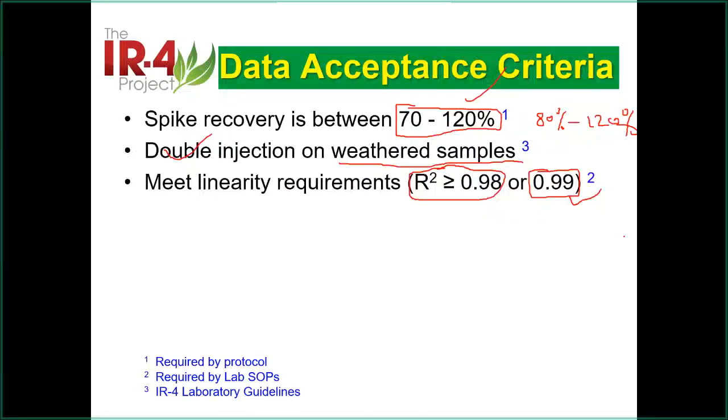For those doing tolerance or MRL work, you don't have hundreds of pesticides to analyze. You have a specific number, parent, metabolite, or mix, maybe 2 or 3 or 4. I never saw anything more than 8 in our study.